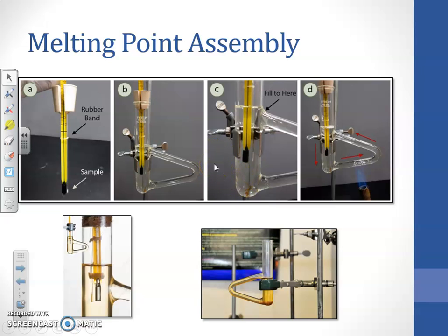The remaining parts are the theory behind melting point determination, the procedure of how exactly to perform it, how to arrange the assembly, and what precautions to take. The most important precaution is that we must never wash this Thiele tube after use or before use. If you want to take it for an experiment, you never have to wash this Thiele tube.